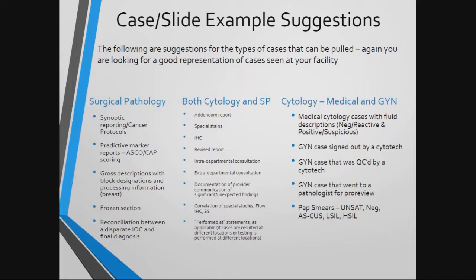Revised or corrected reports. Anything with an intradepartmental or an extradepartmental consultation. Again, these are where you get into that dual role where I've got the case that I can show, and then I also have my example of an intradepartmental consultation report that can also be reviewed.